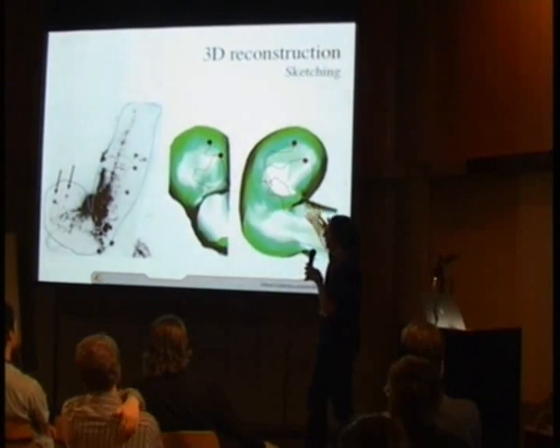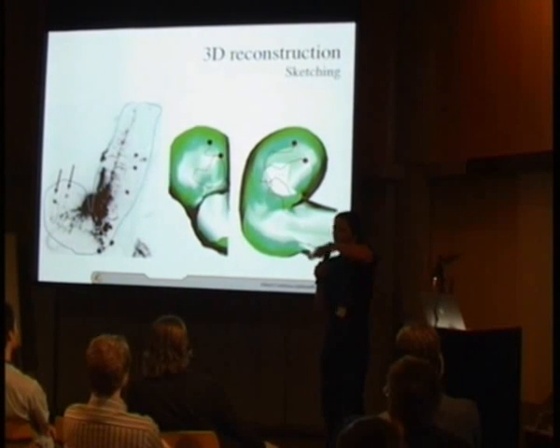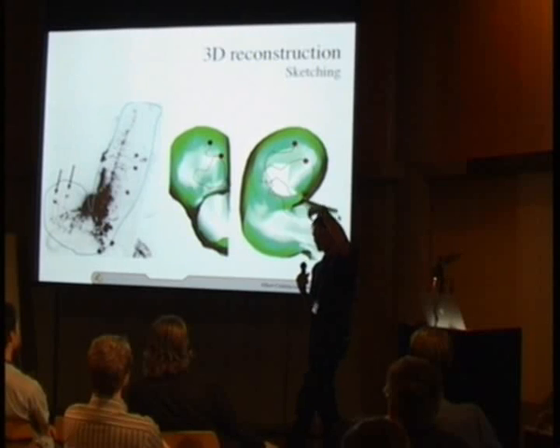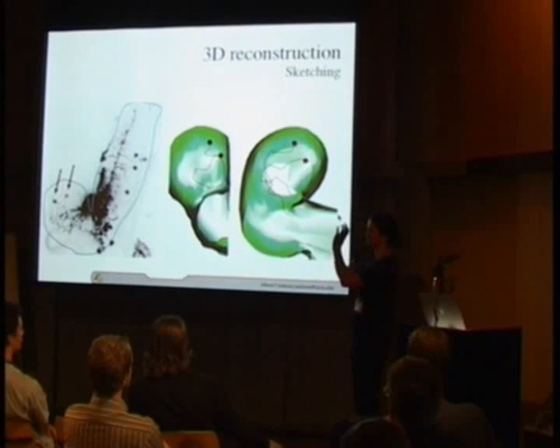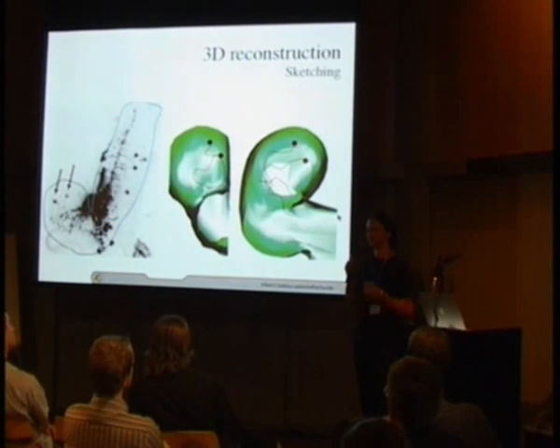But I can see now, mapping this with other renders I had before, which parts of the neuropil, which parts of the white substance of the brain, the fibers and the compartments, they go into and which parts they actually don't go into, which parts they interact with. Really quickly I can have a look at it just by tubes and spheres, and of course having a beautiful mesh rendered with this curve morphing module.